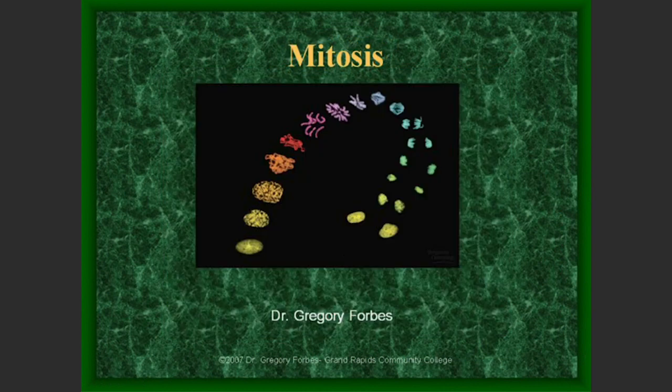Okay, so that's really the short and sweet part of mitosis. You'll learn more details, of course, when you get into lecture, but if you can identify the different stages of mitosis, you know the difference between sister chromatids and chromosomes, and you know what spindle fibers are, and you know cytokinesis, you should be all set.